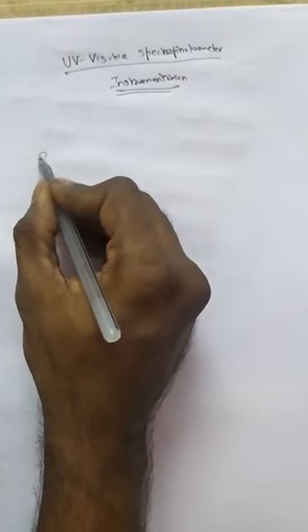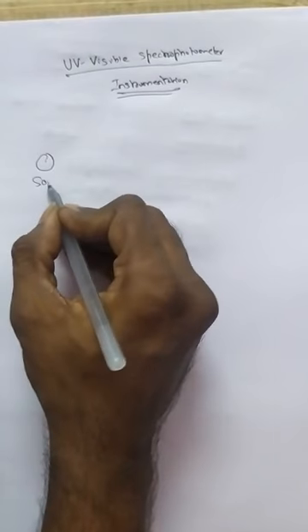Normally for all spectroscopy, there will be basic components, what you call a block diagram. So there will be the basic components of the spectrometer. The first will be the source, the source of the radiation.